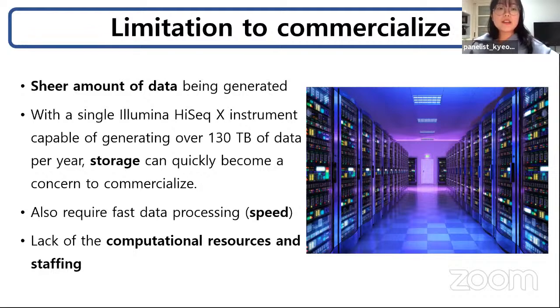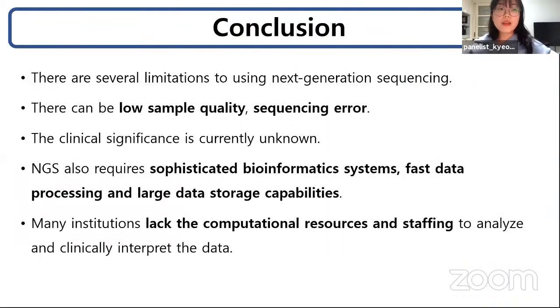Also, it requires fast data processing, and although many institutions may have the ability to purchase NGS equipment, many lack the computational resources and staffing to analyze and clinically interpret the data. Like this, there are many limitations to using NGS in clinical applications now.